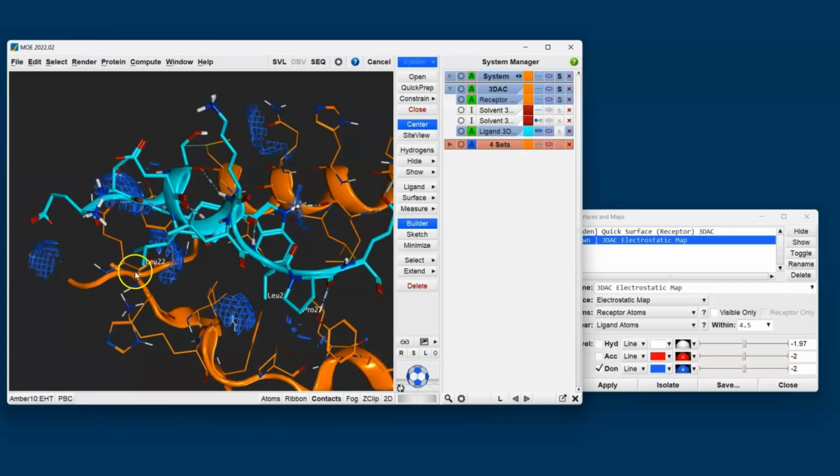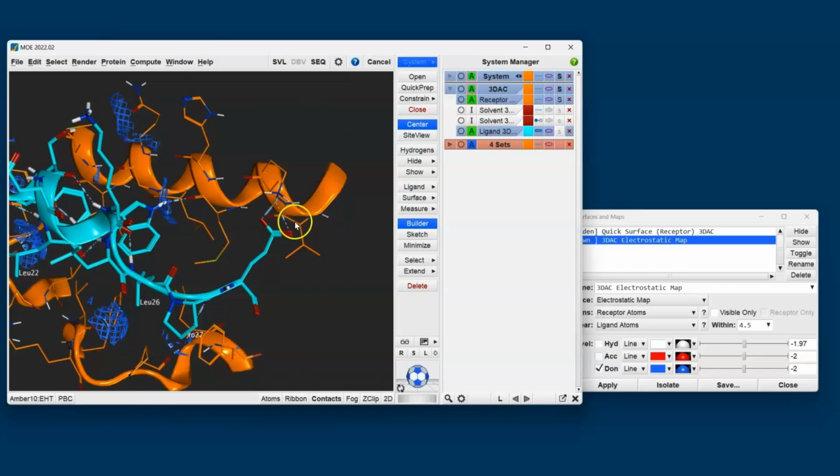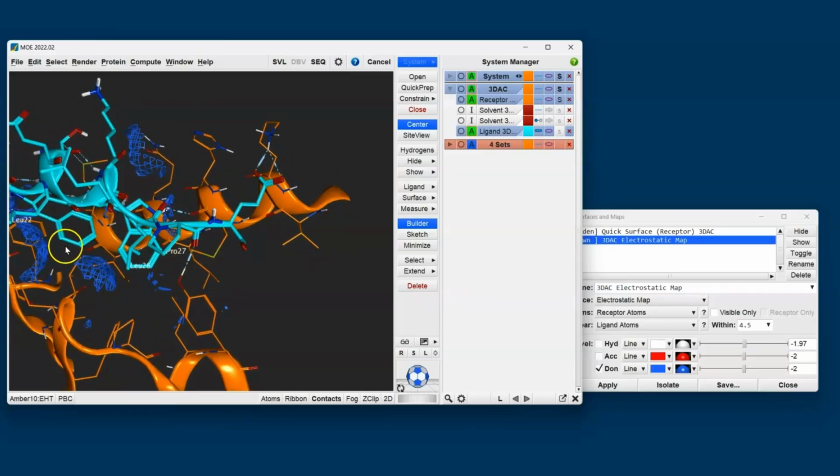I think our strategy here should be to leave those strong bonds that we saw at the termini alone, and we'll preserve those because there's already a good interaction. I think we can leave the hydrophobic interactions that we see buried here alone. They seem to be working well, but we'll build for better interaction with the acceptor hotspot and a better interaction with the donor.